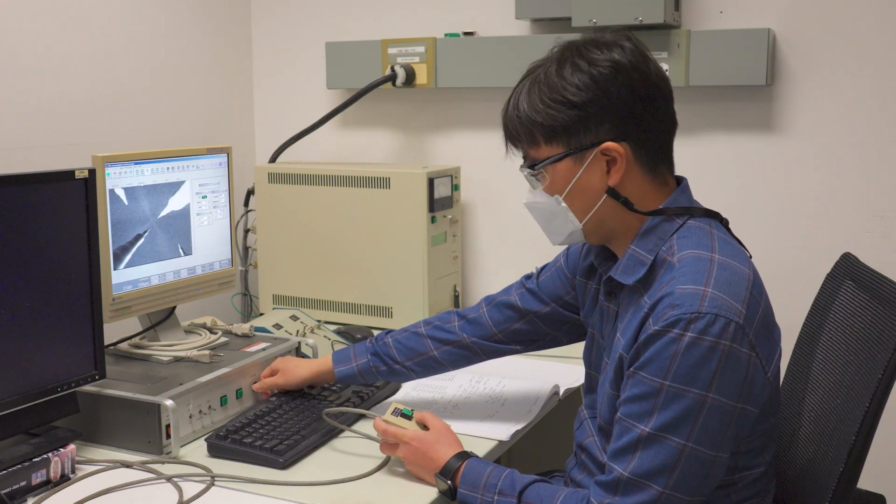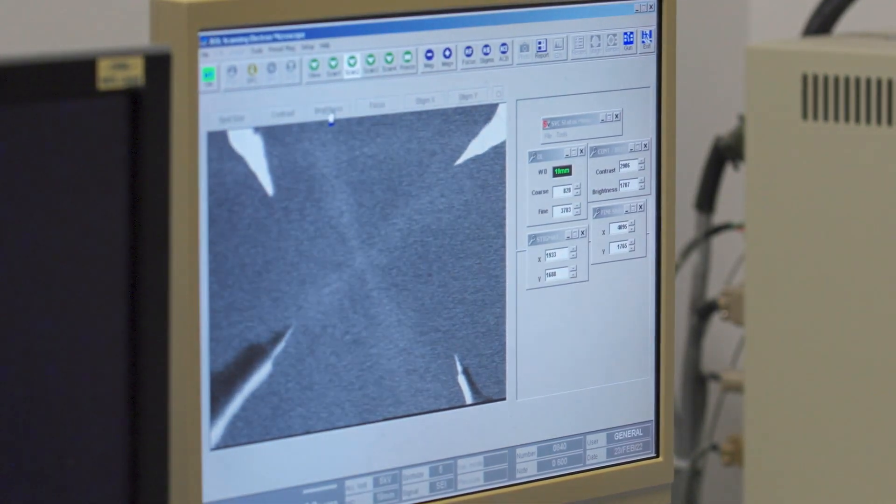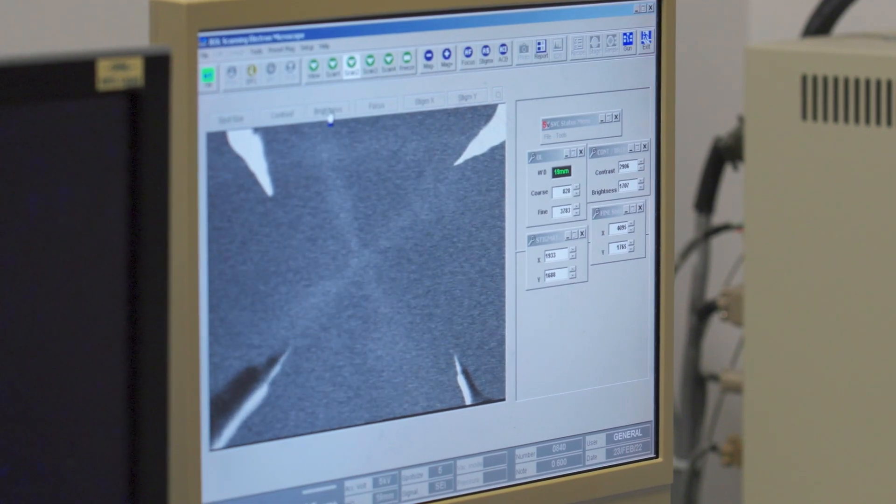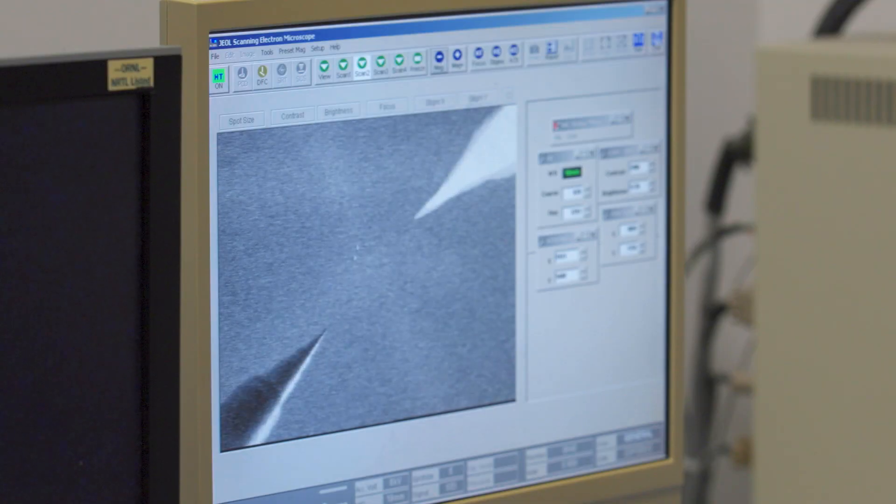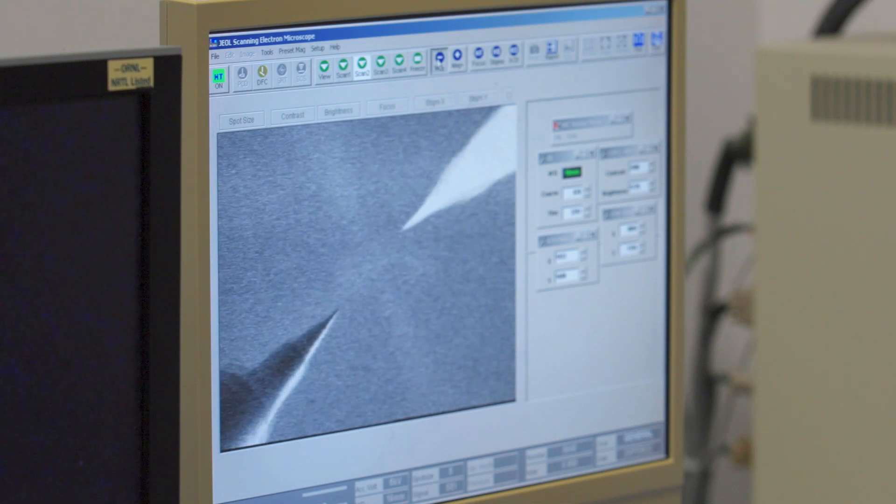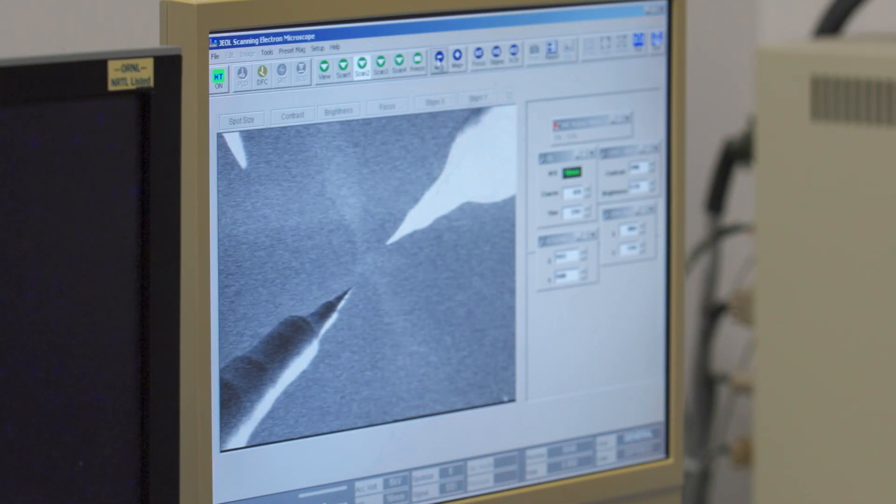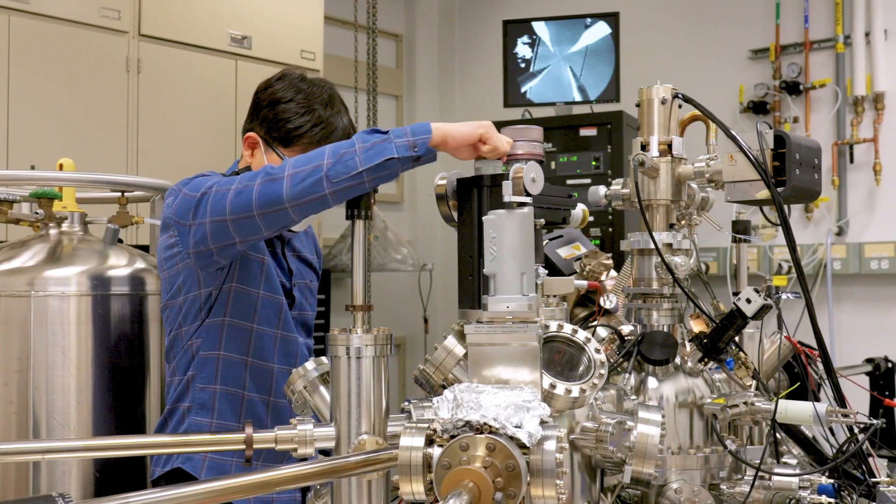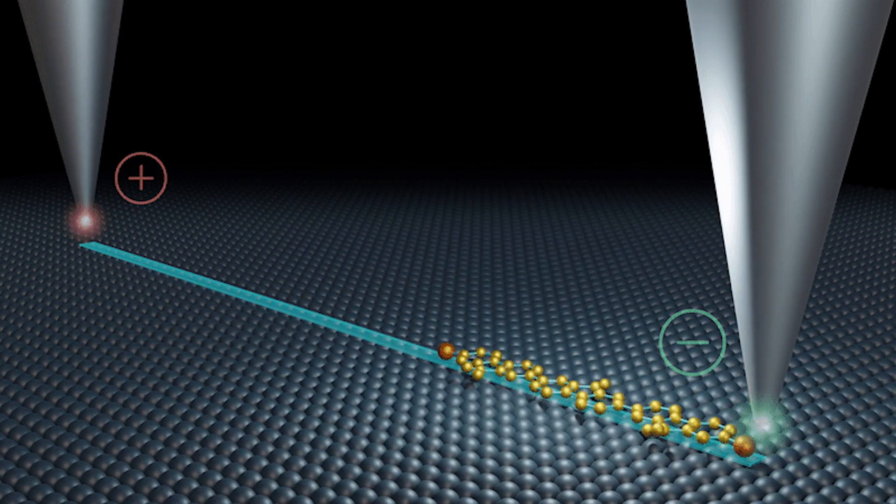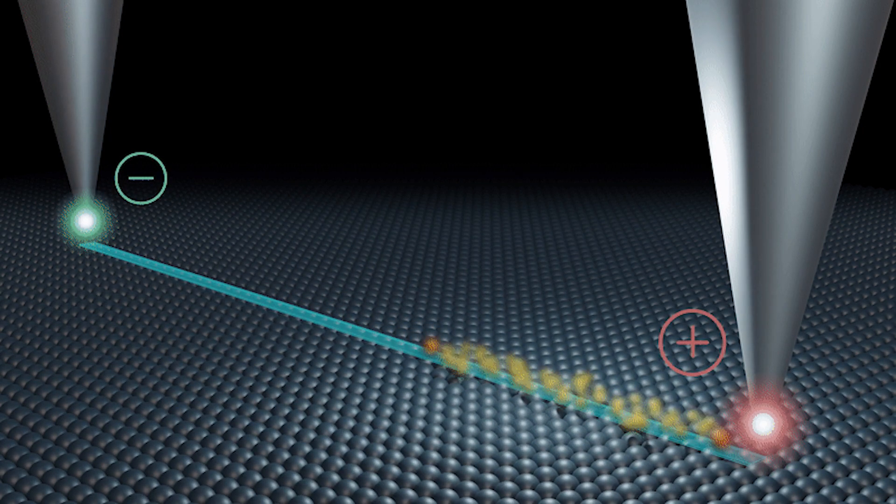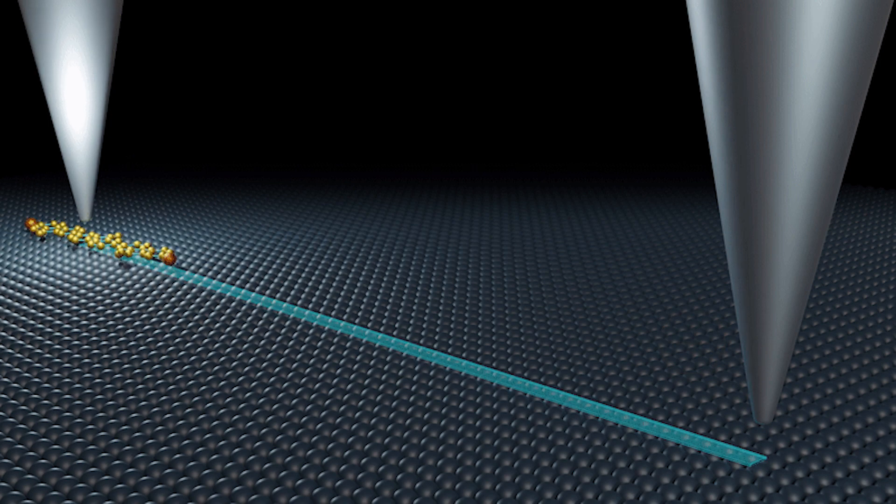We have a very specialized and unique state-of-the-art STM: a four-probe STM which has four STM scanners that you can operate independently. You can do the scanning with all these four probes, get atomic resolution images, and measure electronic properties. But also you can do transport measurements, so you can see how electrons flow from one probe to the other probe. You can get these transport properties of materials by using this four-probe STM all the way down to the atomic scale, which is a very unique capability of this four-probe STM.